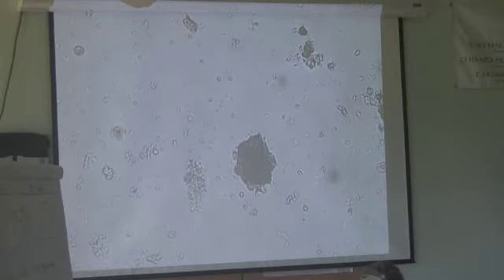Actinobacteria here. Lactobacillus. It's not straight. Tend to be about the width of a bacterium? It is the width of a bacterium because it is a bacterium. Right, but like the smallest guy? It's very narrow. Very narrow, very straight, and typically fairly long. You can get lactobacillus that will chain up. So what you'll see is one lactobacillus and there'll be a little bit of a break, and then the next lactobacillus, a little bit of a break, and the next one. When two lactobacillus join together, you can see a real clear bend sometimes.